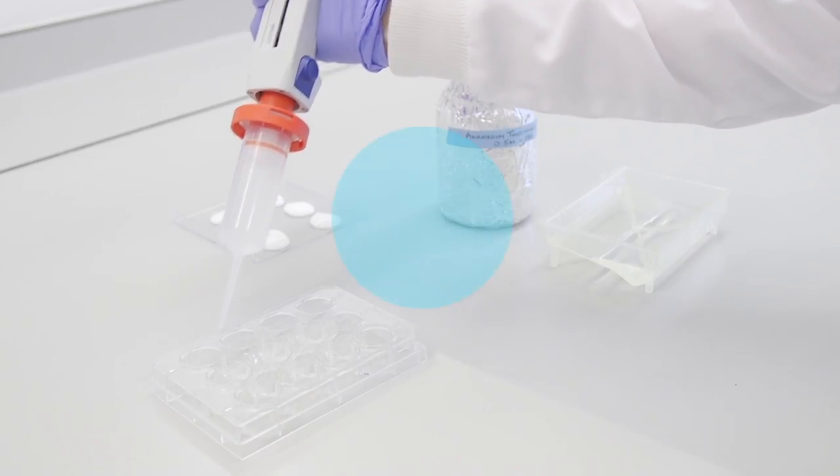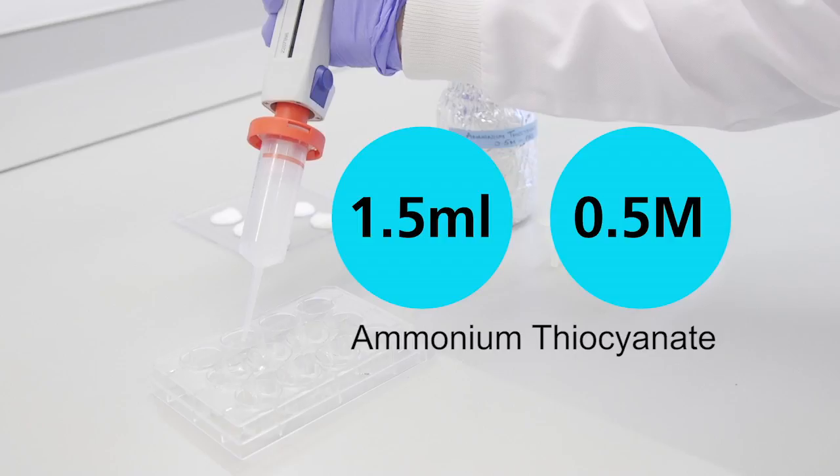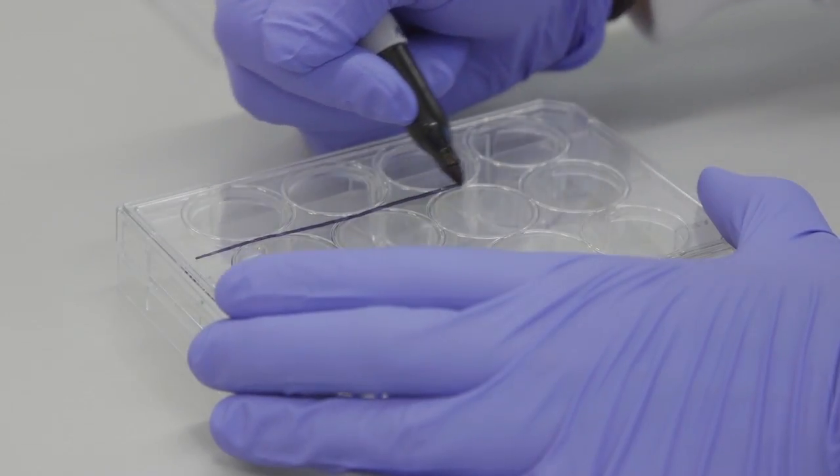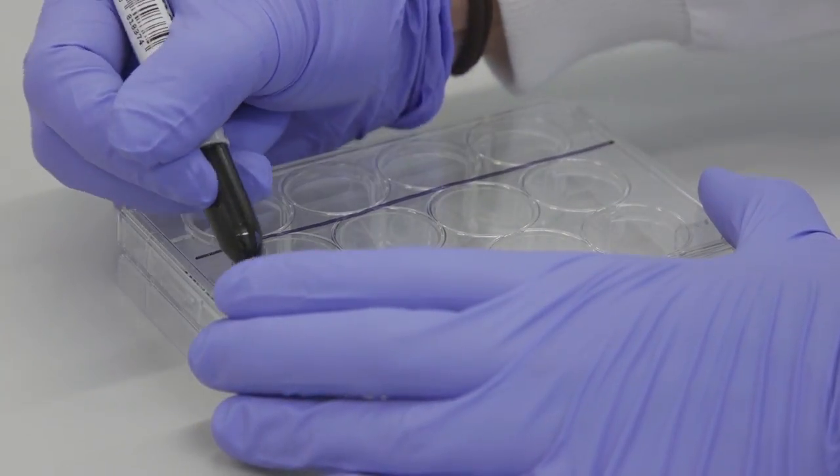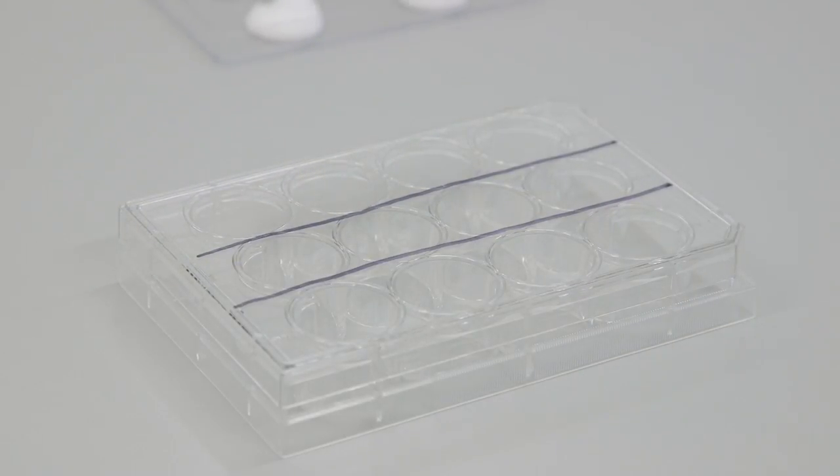12-well plates are filled with 1.5 milliliters of 0.5 molar ammonium thiocyanate per well. 4 wells are required for each set of mouse ears therefore 3 sets of ears will fit onto one plate. If you will need more than one plate it is a good idea to number them.